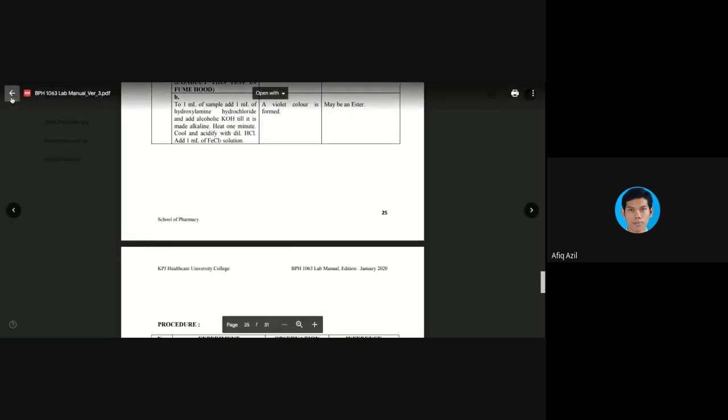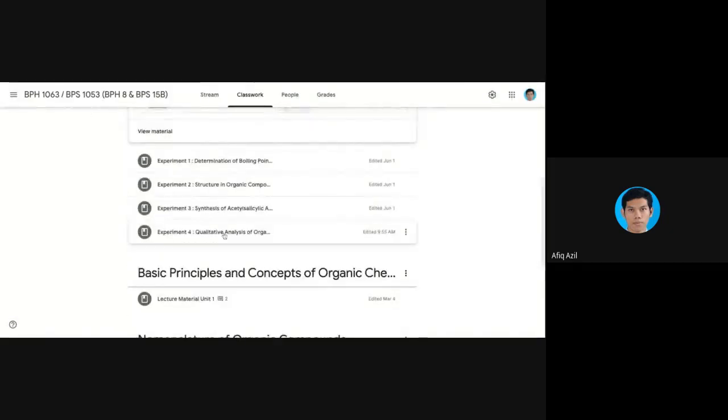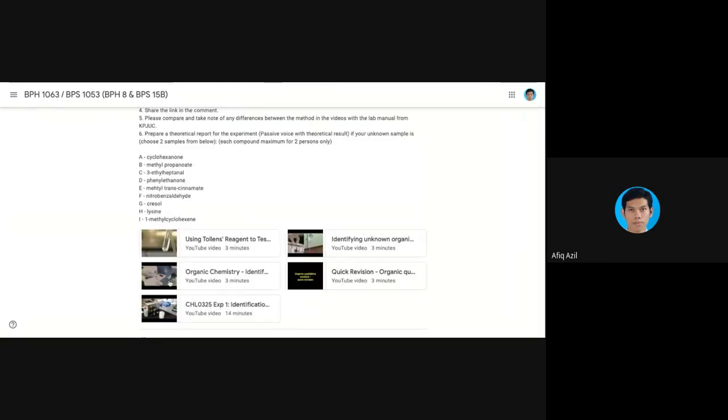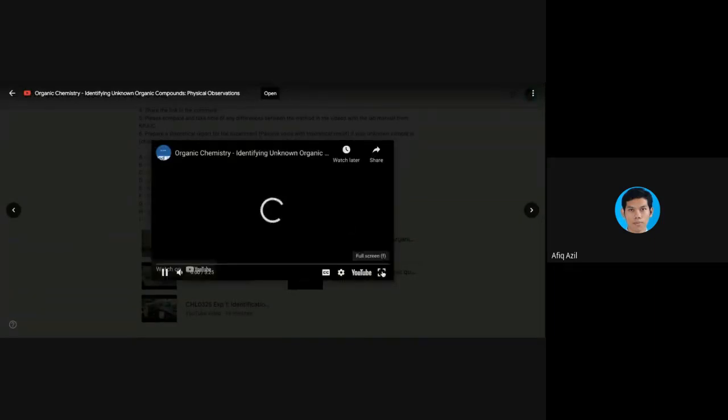So now I will show you some of the video over here. So the first one would be on the physical, okay, on the physical observation.